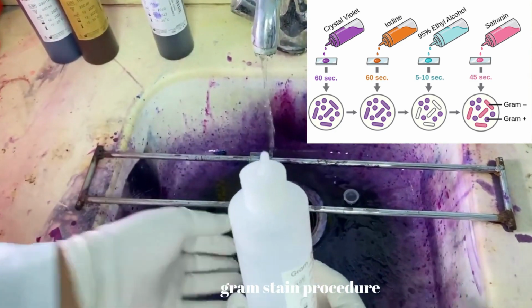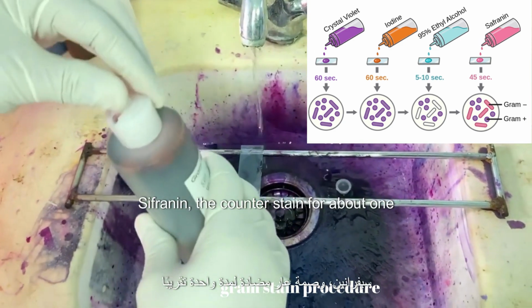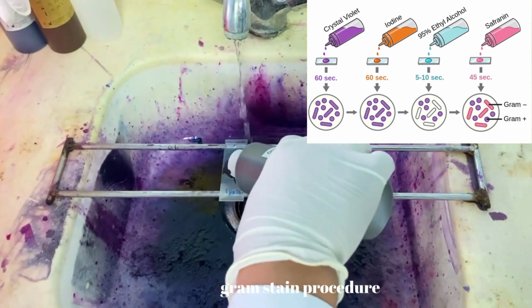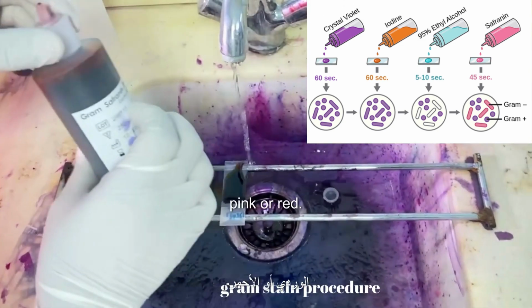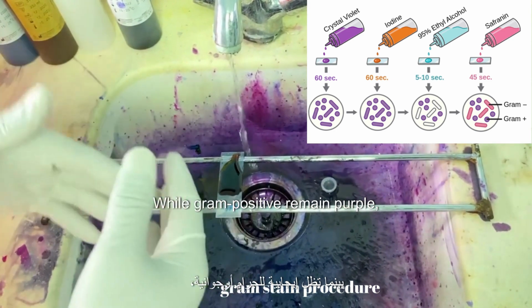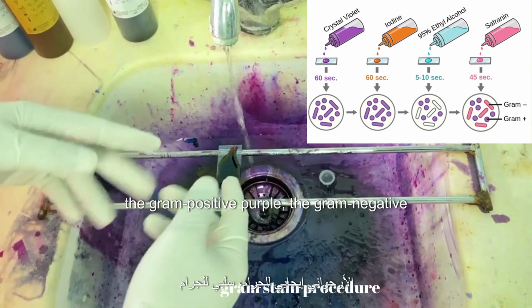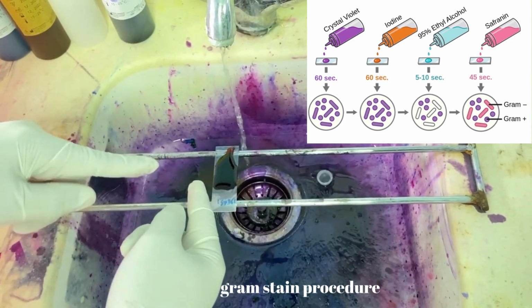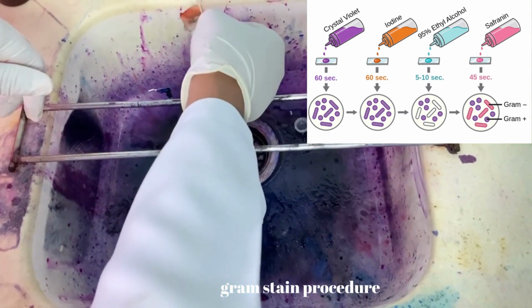The fourth step, safranin, the counter stain, for about 1 minute. Safranin stains gram-negative bacteria pink or red, while gram-positive bacteria remain purple. The gram-positive are purple, the gram-negative will be red. Rinse and allow the slide to dry.